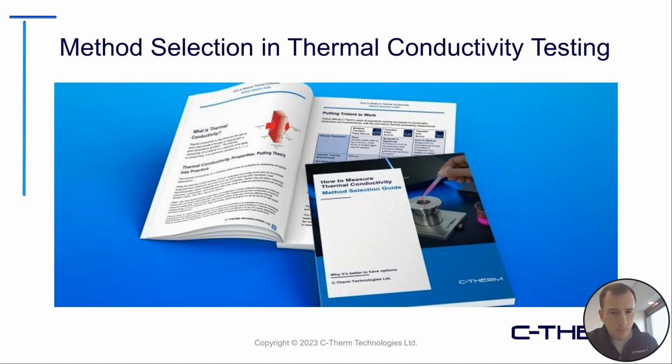Now, because there's a variety of methods available, it's helpful to have guidance on method selection. And this is something that ARIA is really good at. You'll get a sense of that in the presentation, but there is some additional resource materials available, freely downloadable. There'll be a link provided. I see Angad's dropping it in there now. Thank you, Angad.